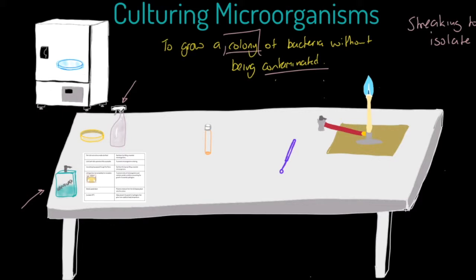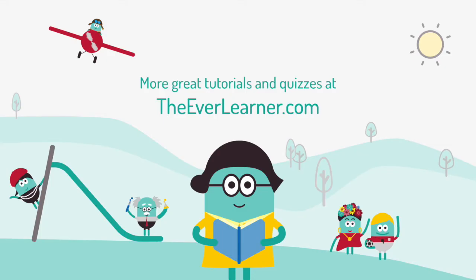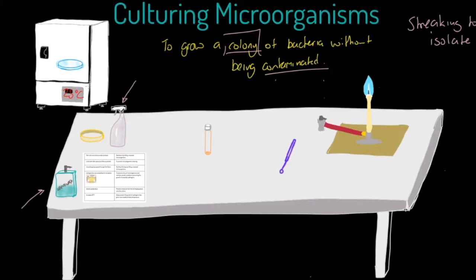We flip it upside down so that moisture from the lid cannot fall onto the agar plate. Secondly, we incubate at approximately 25°C — no higher — because any warmer could encourage bacteria comfortable at body temperature, which we don't want in a school. We tape the lid but don't seal it completely, so air can pass over the agar and prevent anaerobic bacteria from developing.